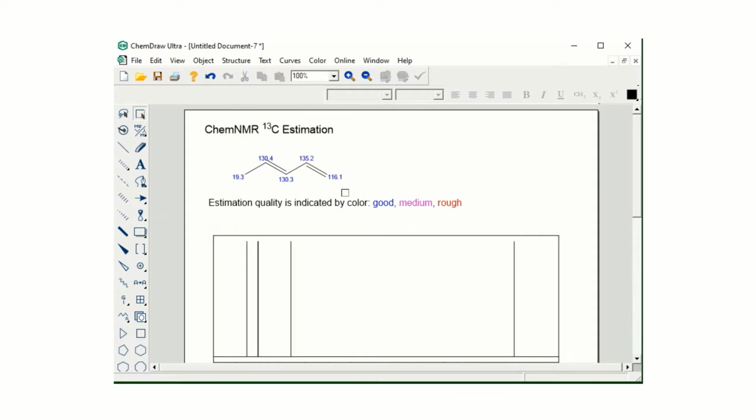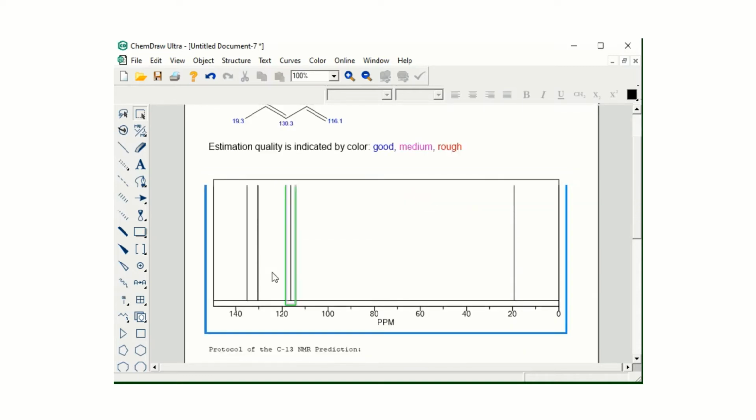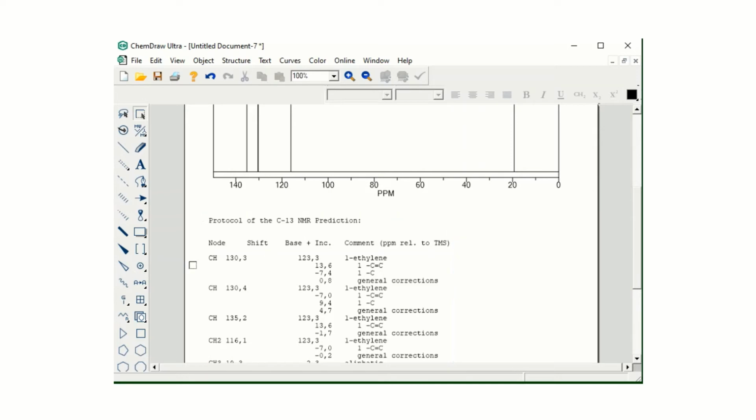You see, this 13C NMR now tells us which carbon is which, as far as the molecule of interest is concerned. You can see here that we have it like this. So we can get lots of useful information as far as carbon NMR is concerned.